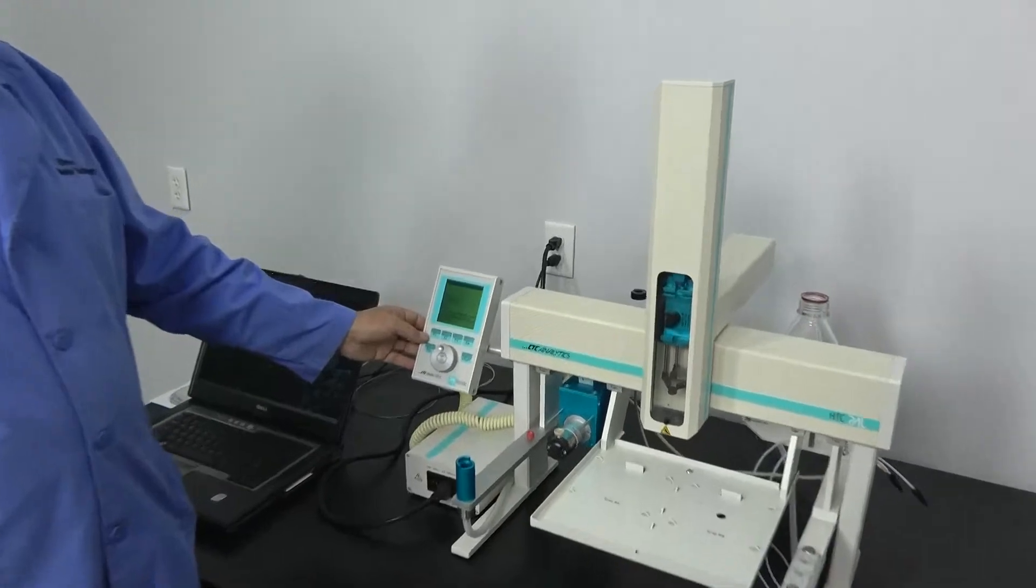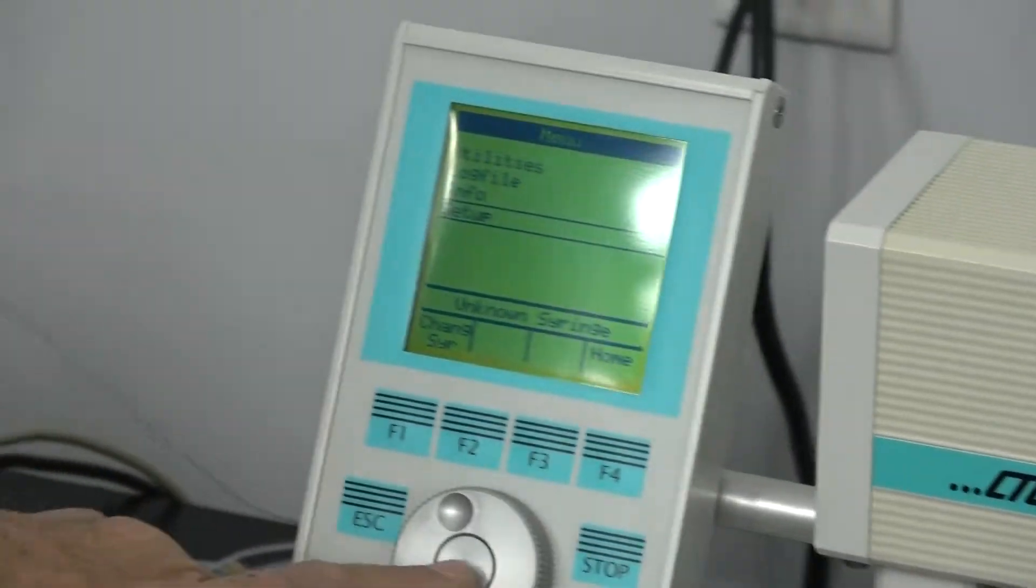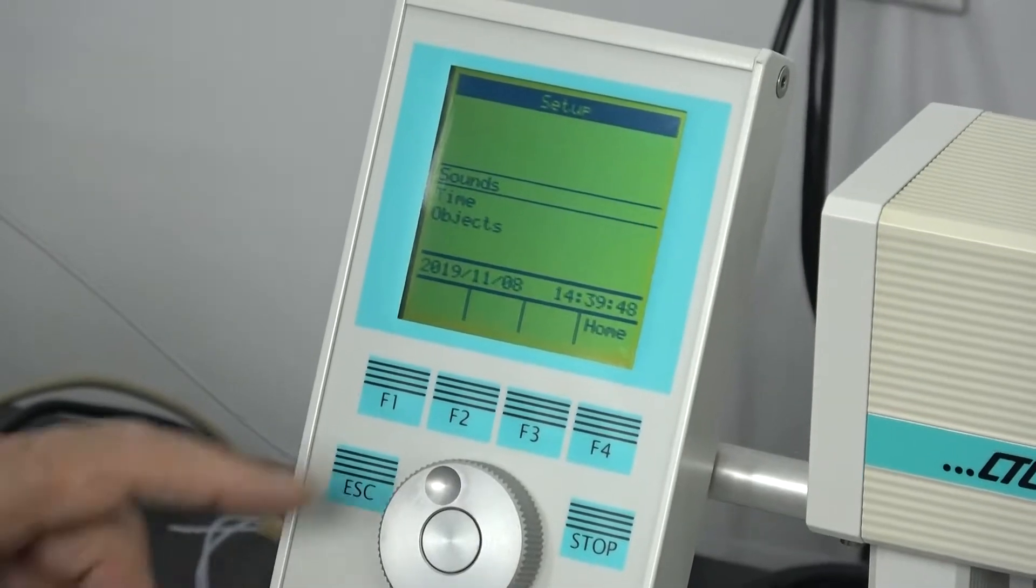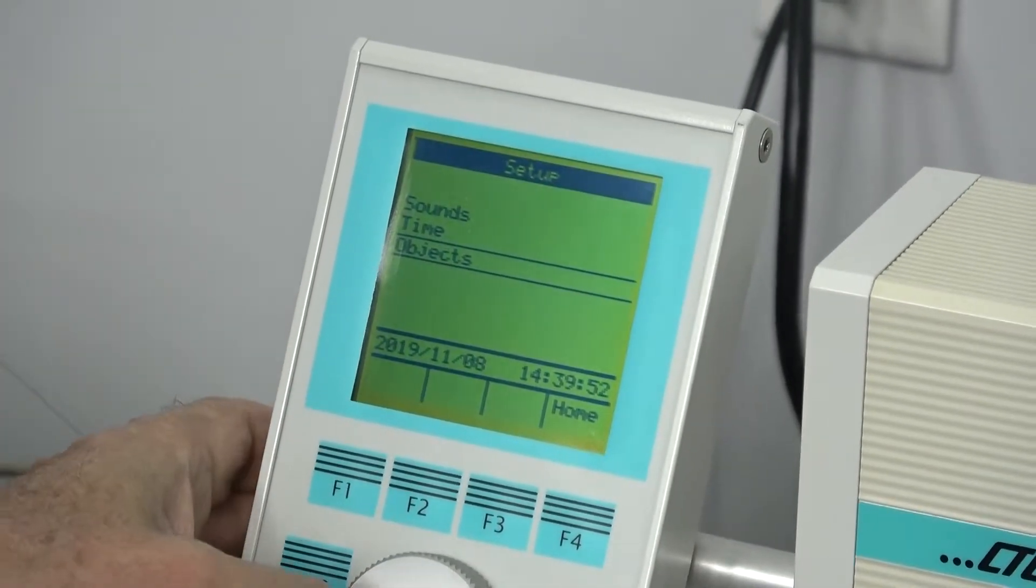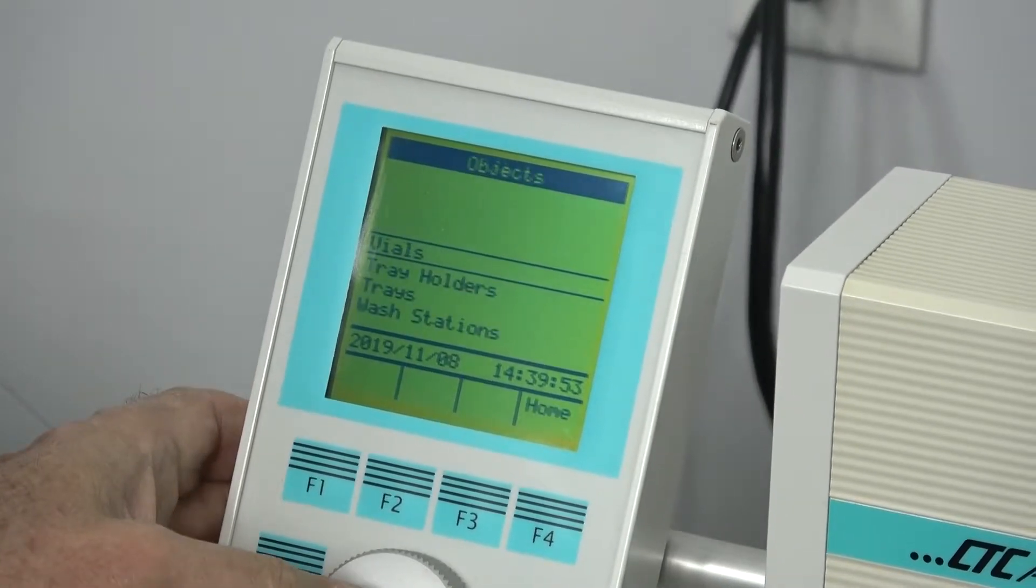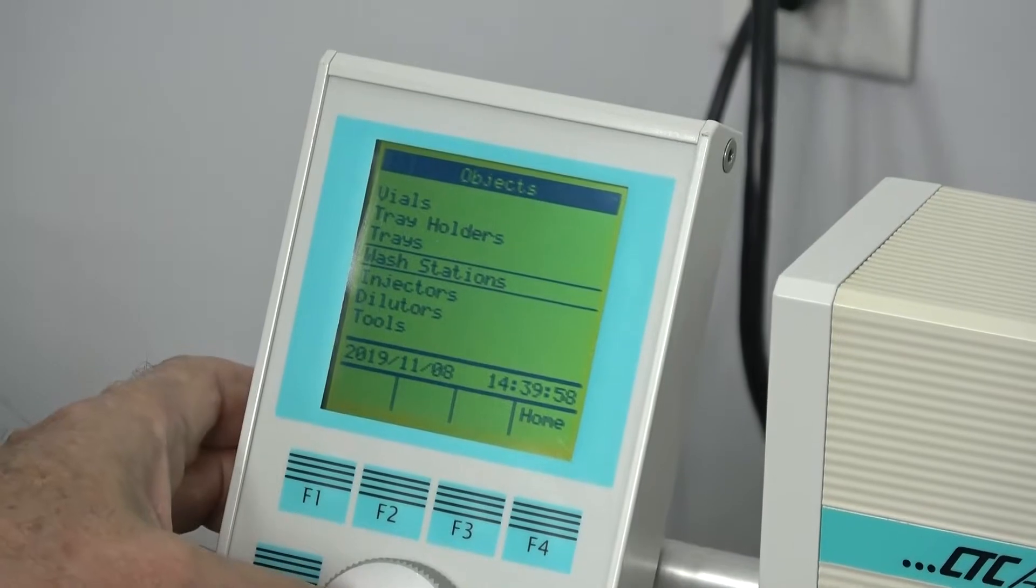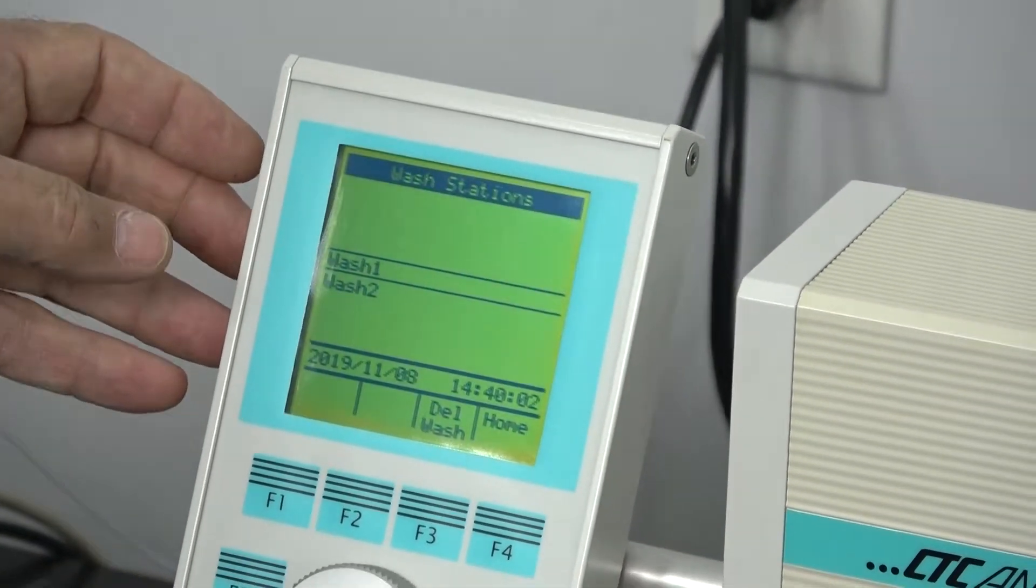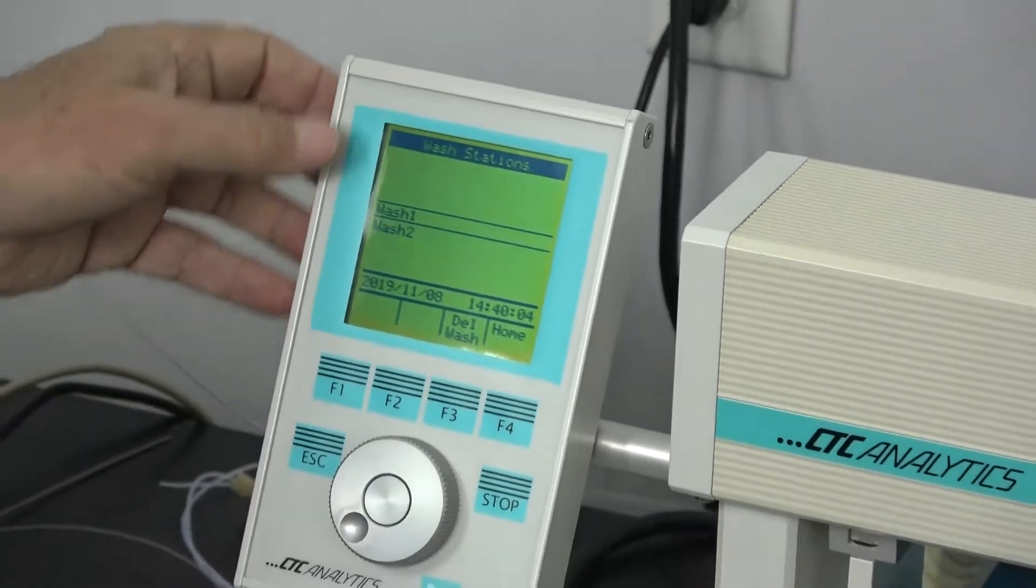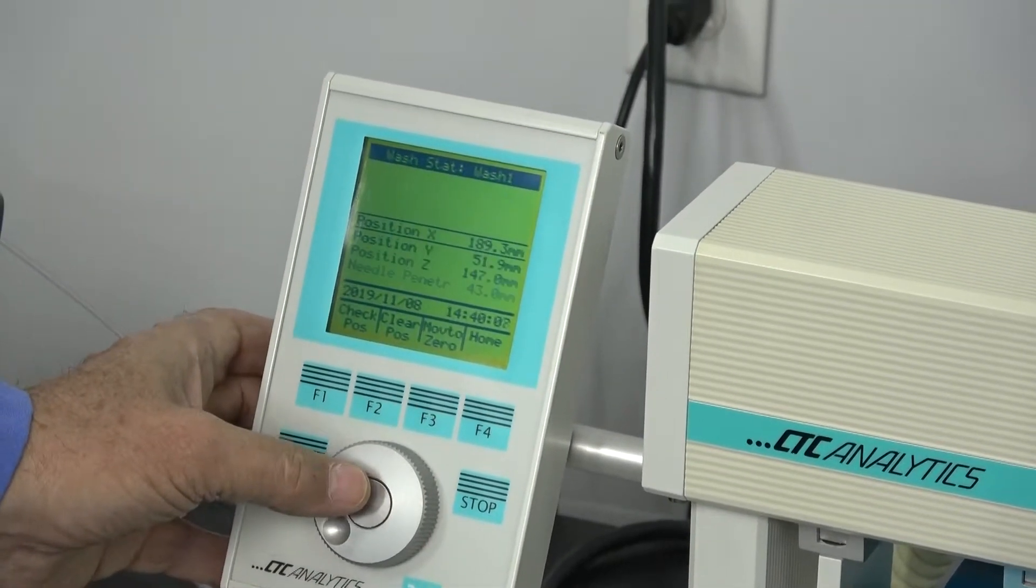You go to your menu. We're going to go into the setup. And here's where the objects is, also where you change the time and such. You go into your object and tell it wash stations. This fast wash has two wash stations. So we can be configured individually. We go to the wash station.